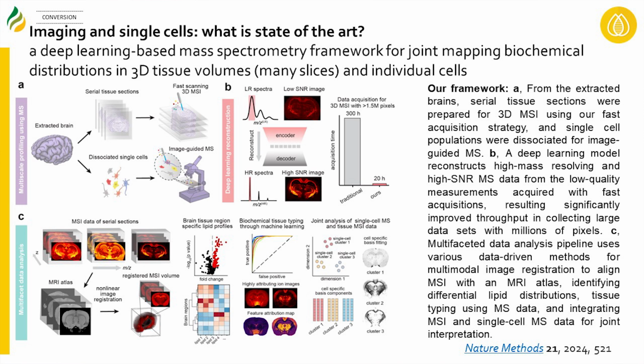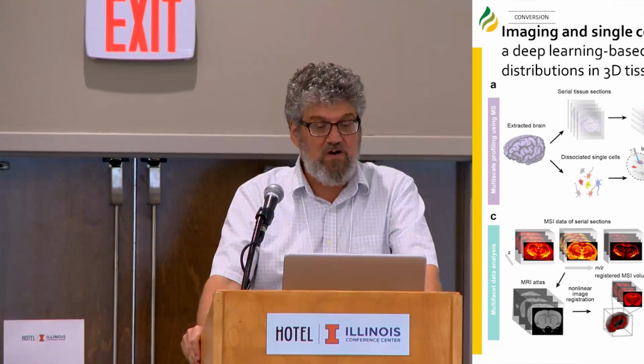And again, partly because it was Nature Methods, it was really emphasizing some of the aspects that were for a brain. But every one of these do work in plants. And it gives you this ability to actually compare what's in the individual cells, what's extracellular, and how to put this together. In terms of an application here, it would really be fun to look at the root microbial ecosystem to see where metabolites are.